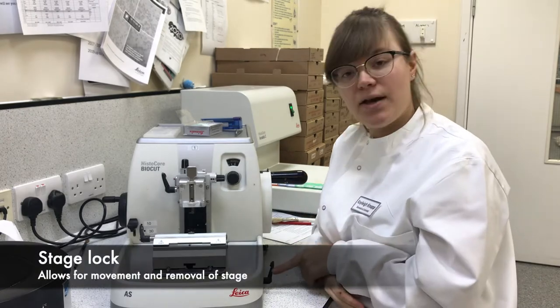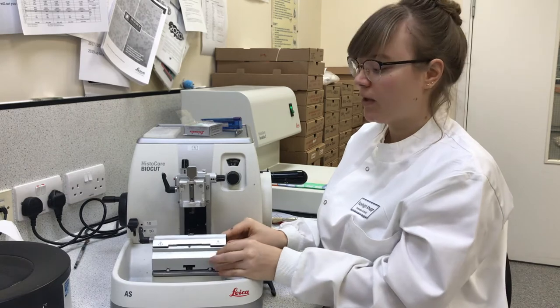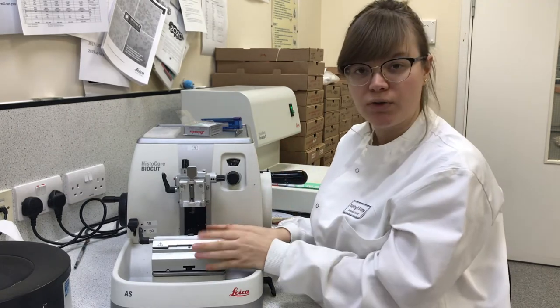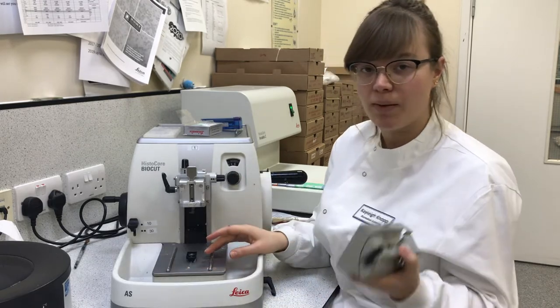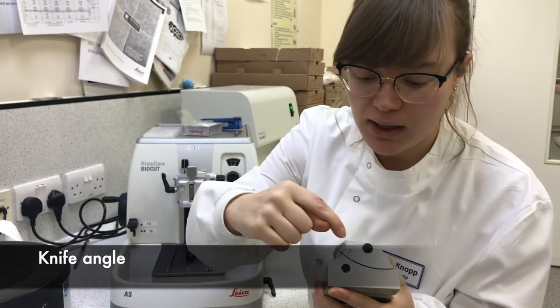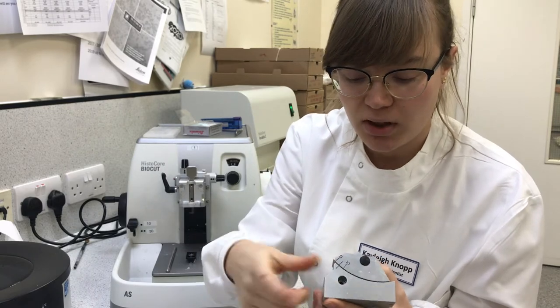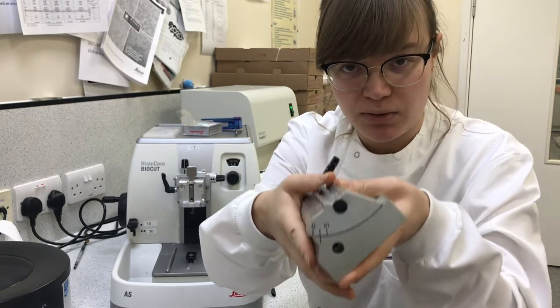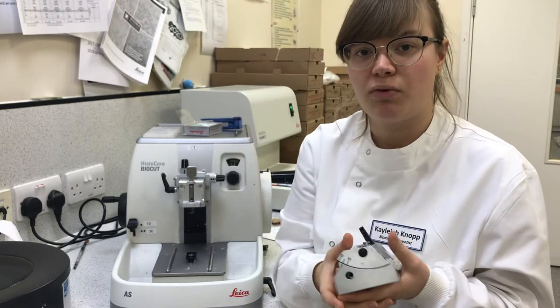This lock down here — unlock it and this slides to bring your knife holder closer or further away from your chuck. This also comes off. You'll see on here that it has zero degrees, five degrees, and ten degrees. You want it on five degrees, this middle line. Changing this changes the angle at which the knife goes through the specimen — the optimal angle is five degrees.